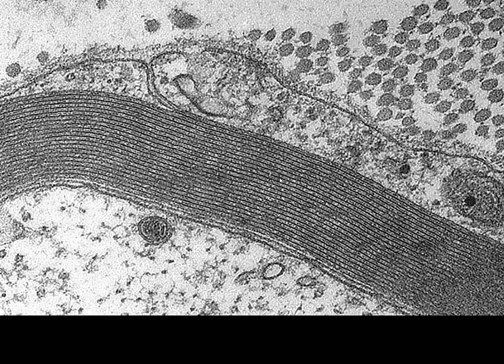Now, we've seen this one in our lecture podcast, but this is where we see the very dark, intense lines, the major dense lines. And then you have to use your imagination a little bit, but almost the dotted line that you see running between, those are going to be the intraperiod lines. The dark lines are the two cytoplasmic faces of the plasma membrane together, and the intraperiod line are the two extracellular membranes that are opposed.